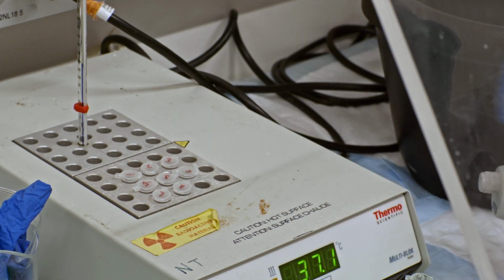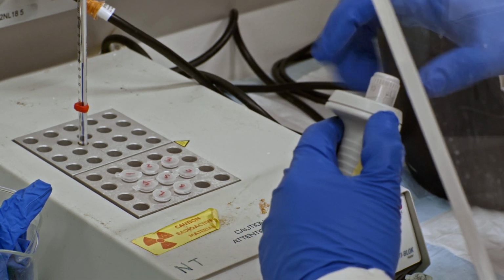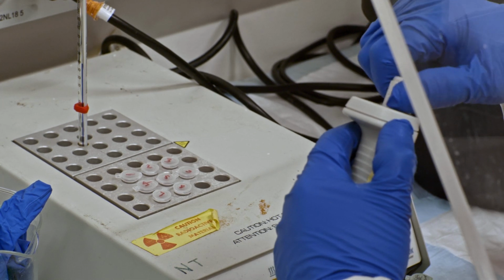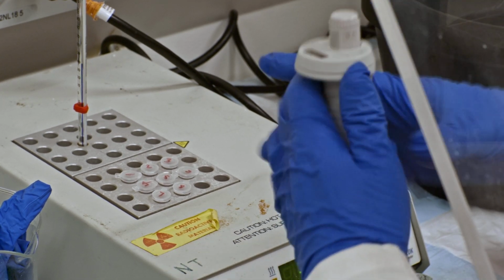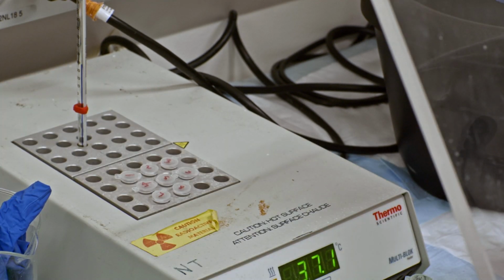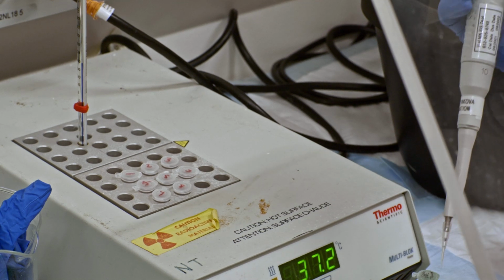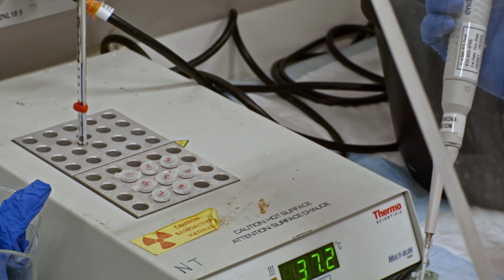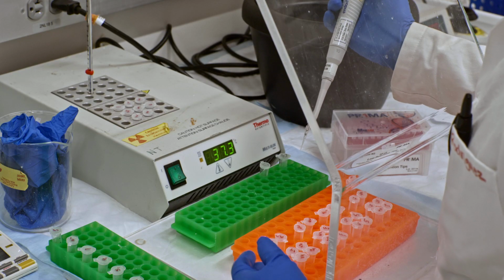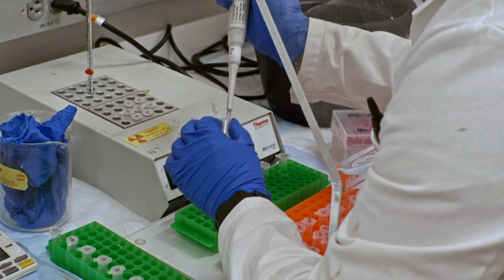What I'll do then is I'll get my micropipetter, set it to 4 microliters, and get ready to get my first aliquot from reaction vessel 1. So we're currently at 5 minutes, and so I'll let this go for a few more seconds, about 15. So we're nearing the time now. Gonna get reaction vessel 1. Gonna get a 4 microliter aliquot.